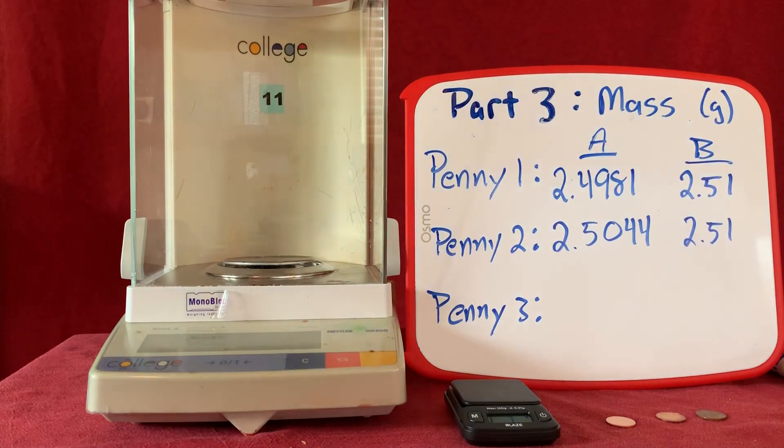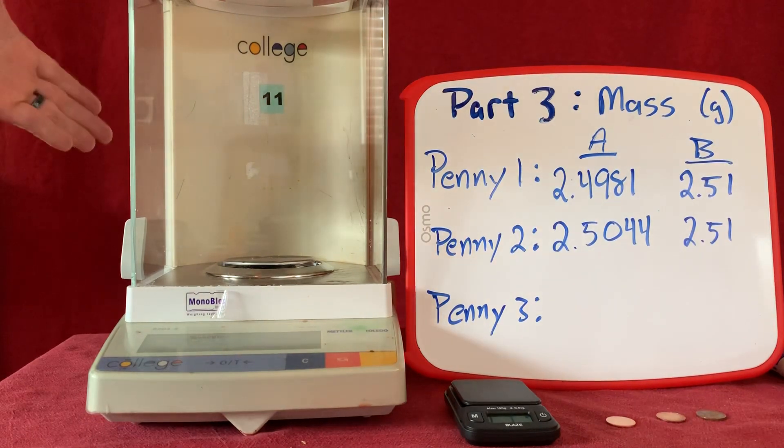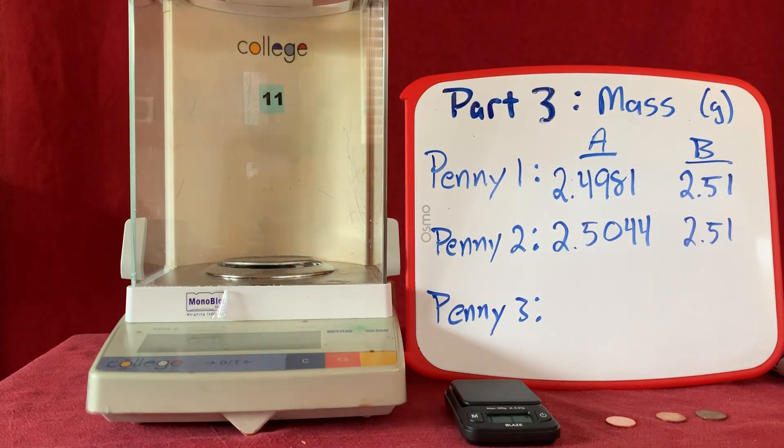We also got two different balances. We have a Mettler-Toledo balance, very commonly found in college chemistry labs, and also have a Blaze balance down here from a home chemistry kit. We'll be able to compare the precision of these two different devices.